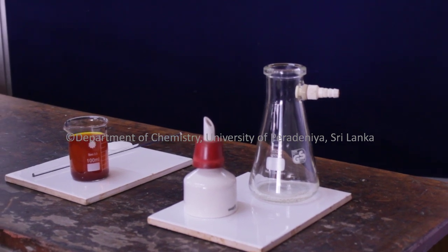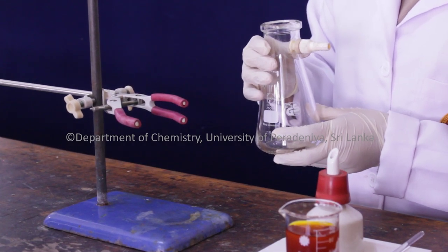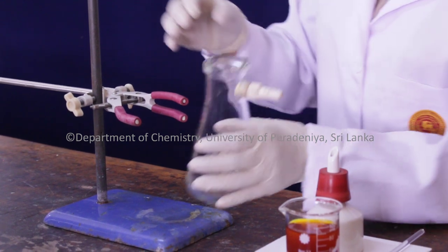Now let us look at how to use a Buchner funnel. First, we have to take a clean Buchner flask and clamp it to a stand to ensure the stability of the whole setup.